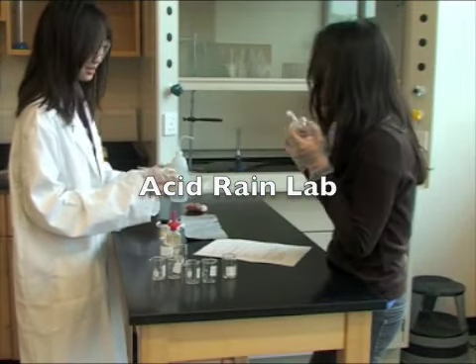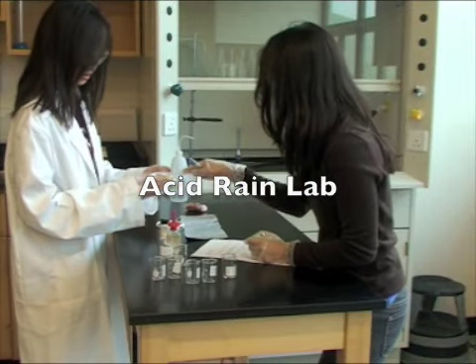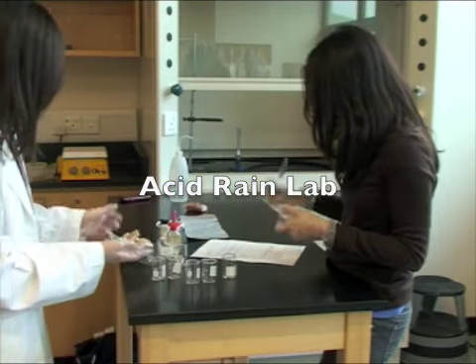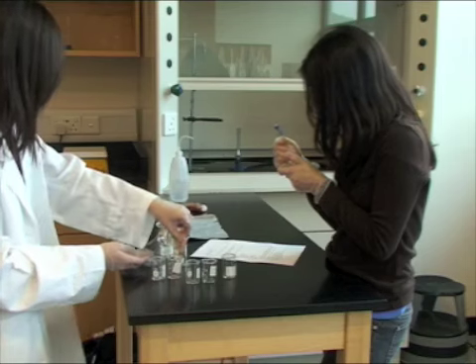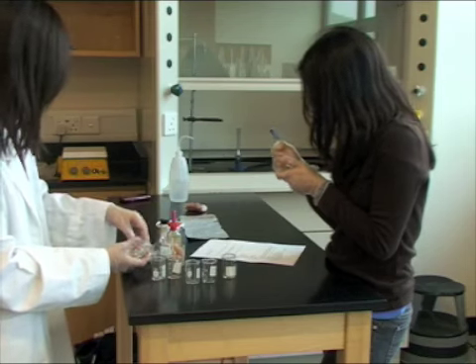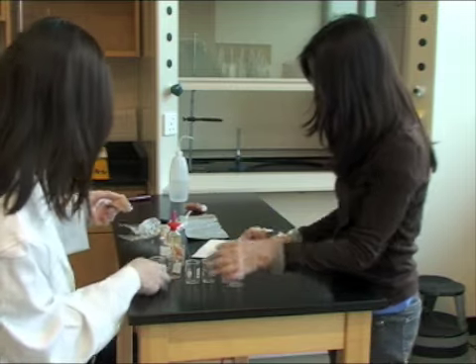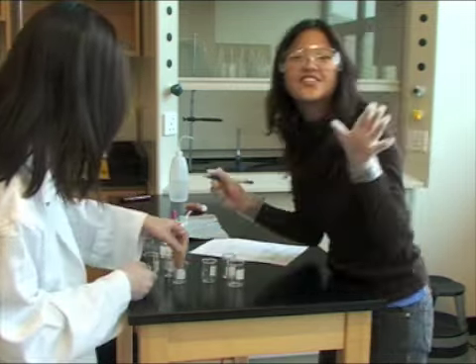Our group did our lab on acid rain. We tested the effects of sulfuric acid on pork, fish, aluminum foil, and limestone. We used water as a controlled variable to test on all of those materials as well.